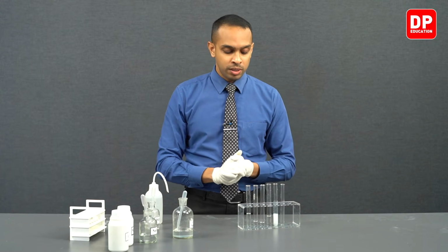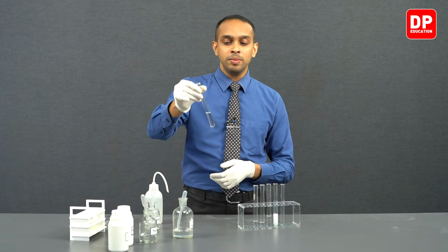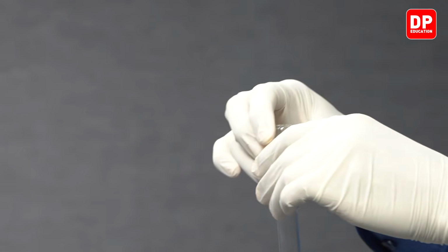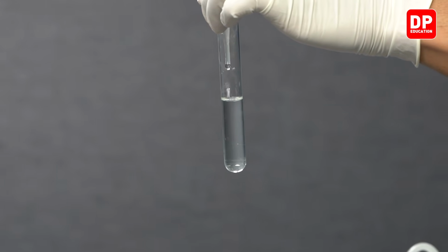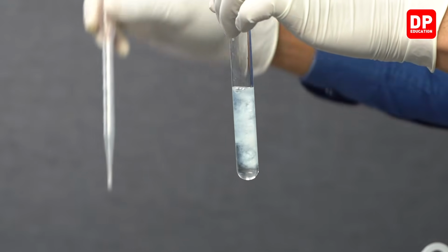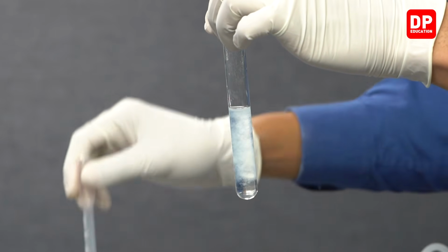So we observed if you take aluminium 3+ ions, when you add sodium hydroxide to it, it will produce a white color precipitate.